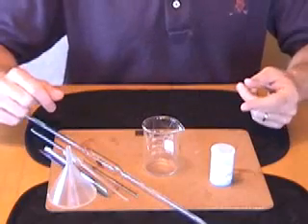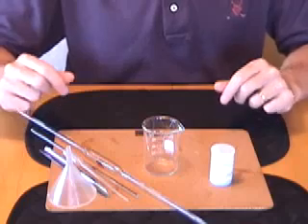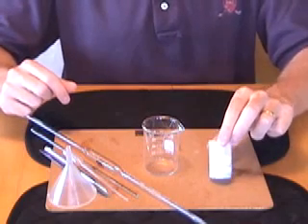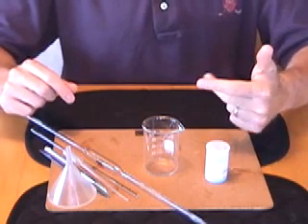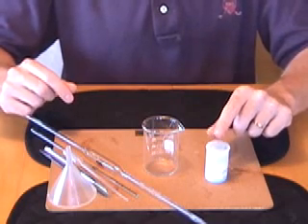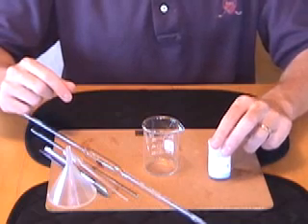One of the laboratory skills that you really must master at this level of chemistry is how to prepare a solution. So let's say we have some copper 2 sulfate and we want to make a solution out of it. Well, first of all, we have to know the concentration of our solution. We have to know what volume we want to make in order to work backwards, and we'll do that in a calculation soon, to calculate the number of grams necessary for the copper 2 sulfate in the solution.